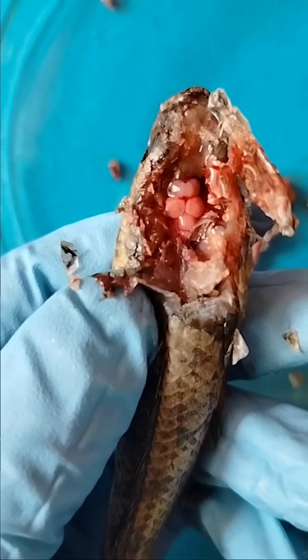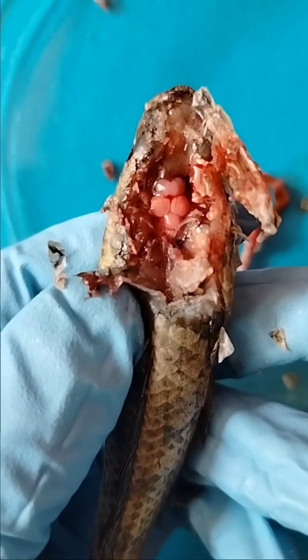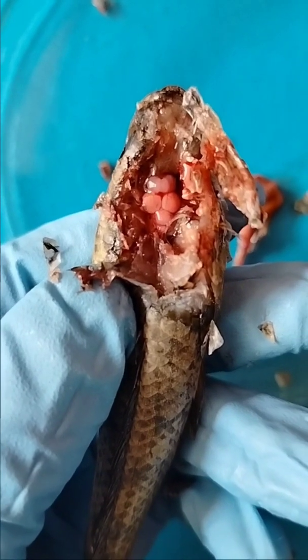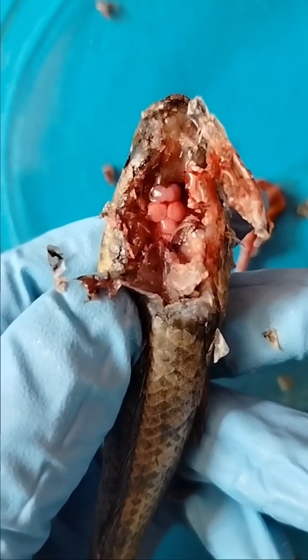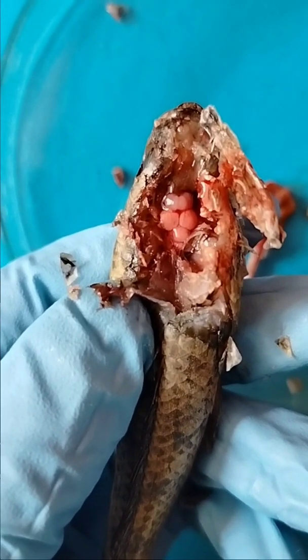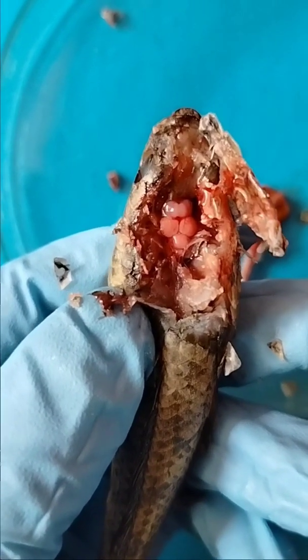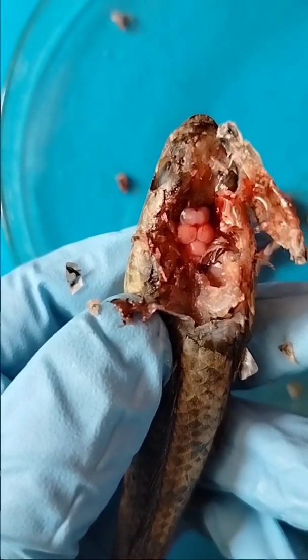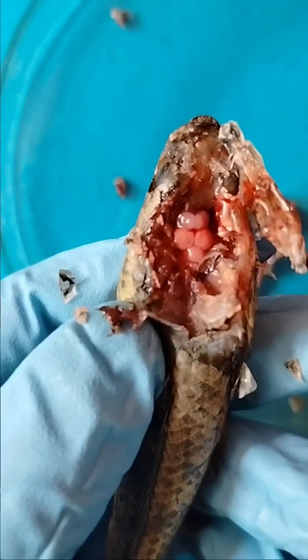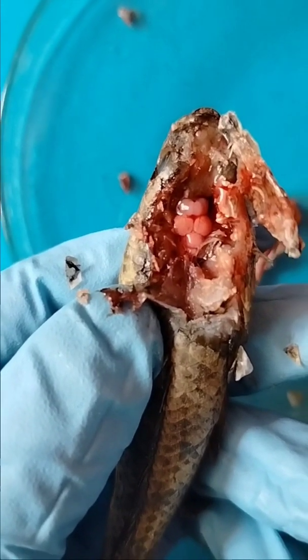On removing the brain case or cranium, the brain is well developed and remains covered with a good amount of adipose tissue. I have removed this adipose tissue with the help of my scissors and sharp and pointed forceps. The olfactory lobes and cerebral hemispheres are distinct and well marked. Olfactory lobes occupy the anterior part of the telencephalon.